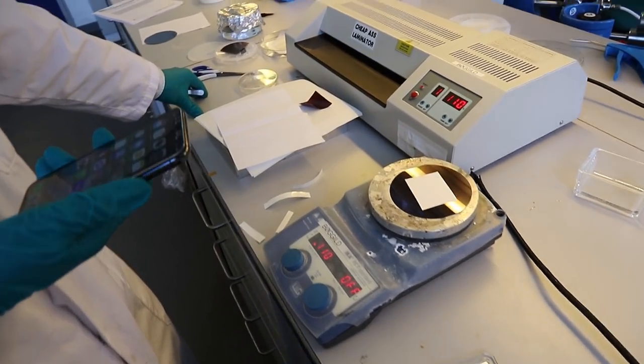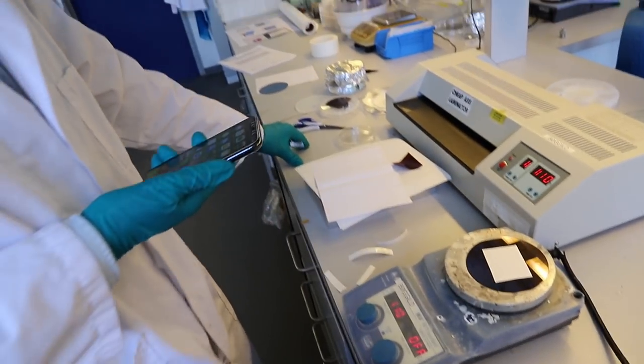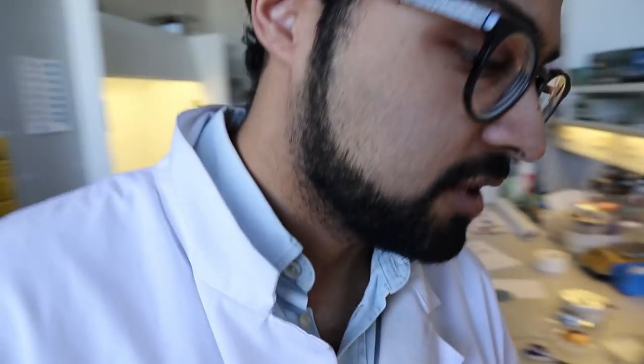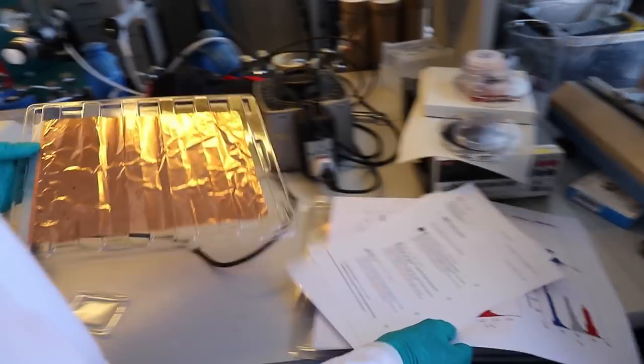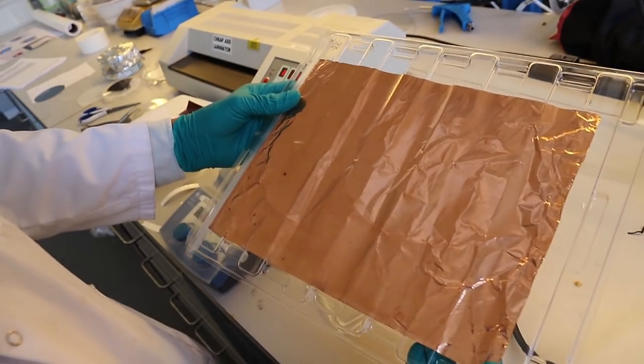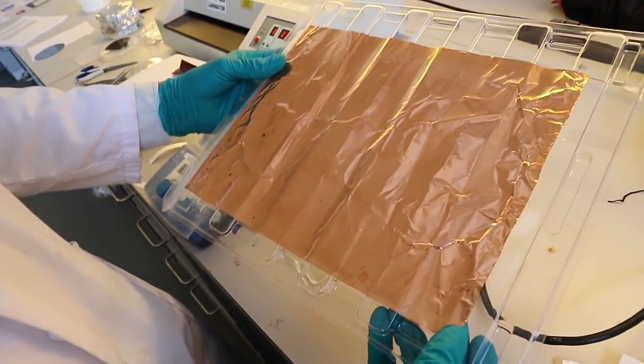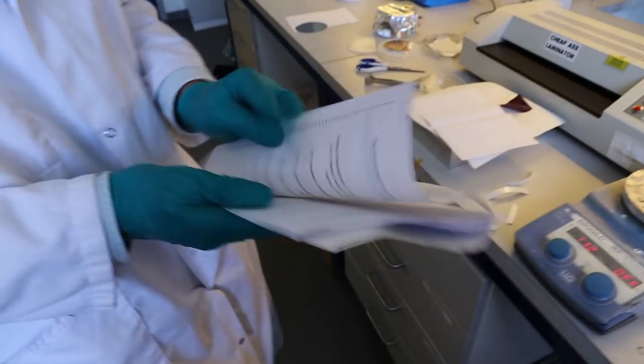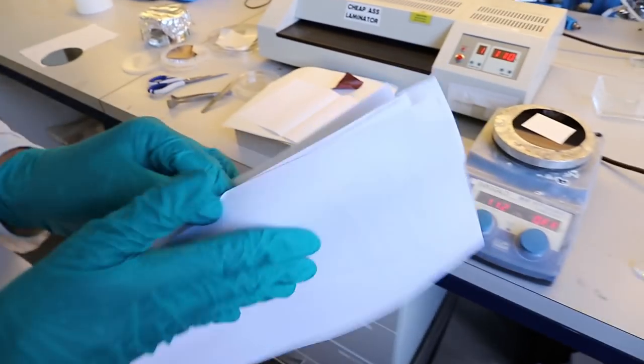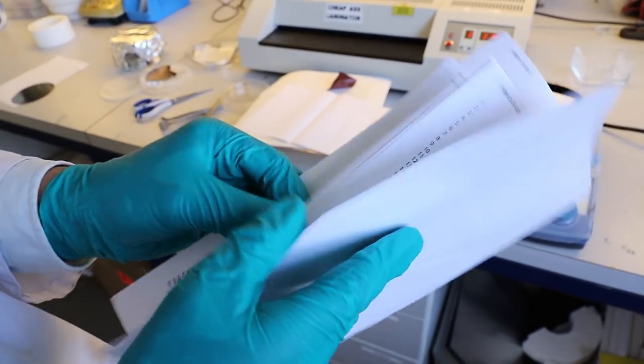Okay. So how large pieces have you transferred in this way? We have transferred sheets of up to A4 sizes. So we actually have transferred entire foils. This is in fact one of the copper foils that we had transferred using the PVA foil approach, which we see actually in the paper.